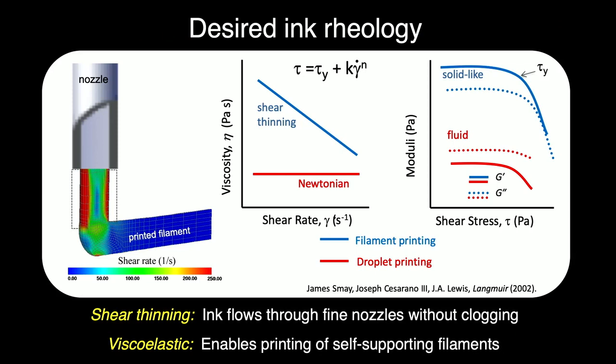So we are engineering in the shear thinning response. This means they flow more easily the higher we apply pressure. But as they exit the nozzle and go back into a quiescent or zero shear condition, they rapidly re-solidify. And that re-solidification process is inherent due to the structure that I described, this gel type structure.